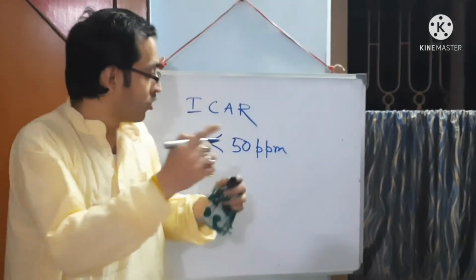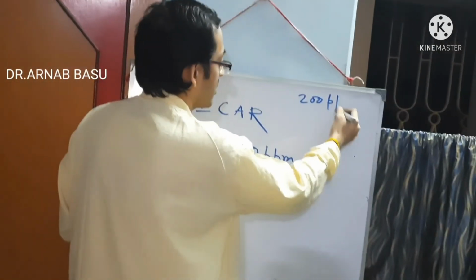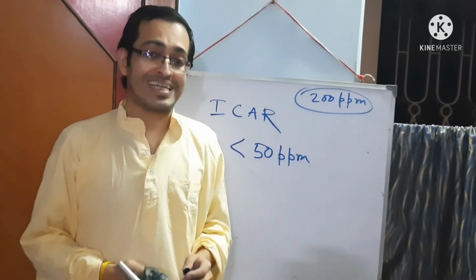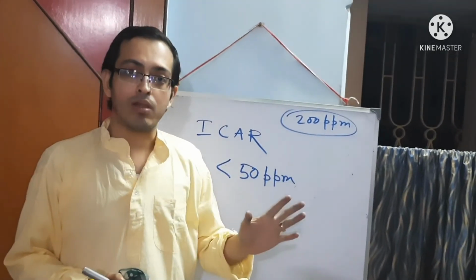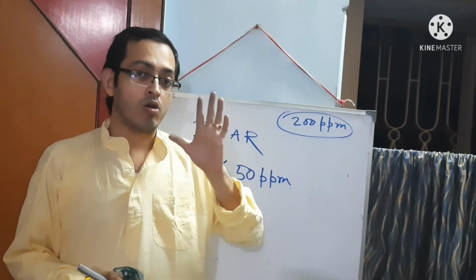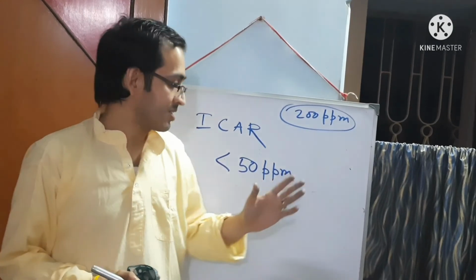And your value is 200 ppm. So it is clear that you should conclude that your water sample is not good or suitable for scientific fish culture.